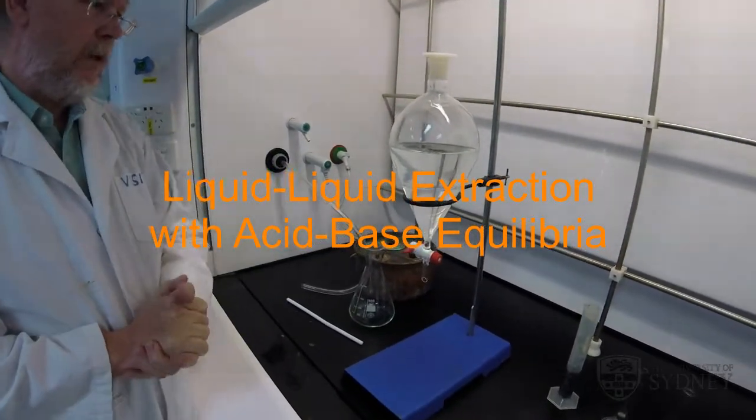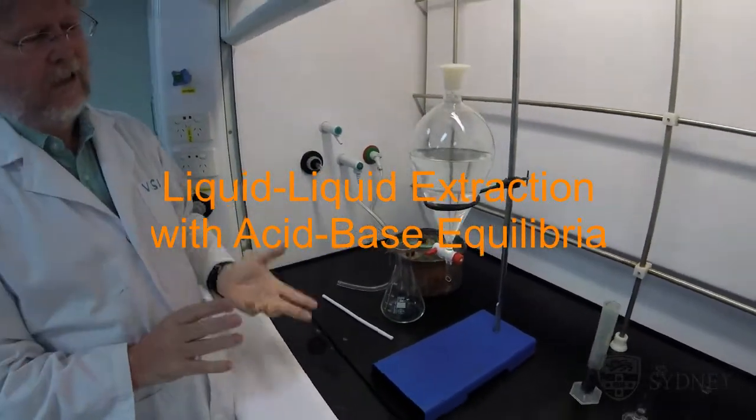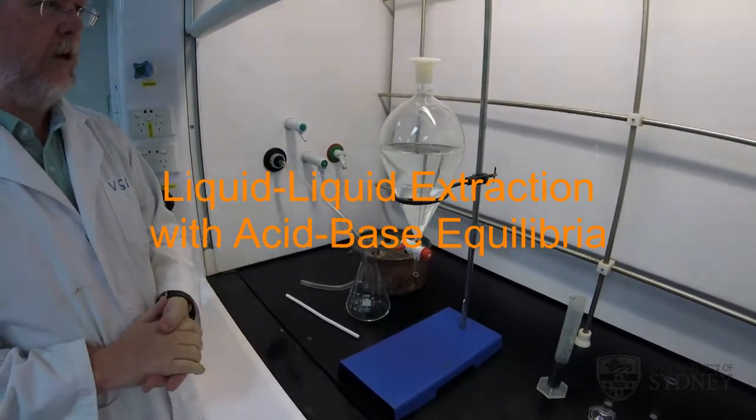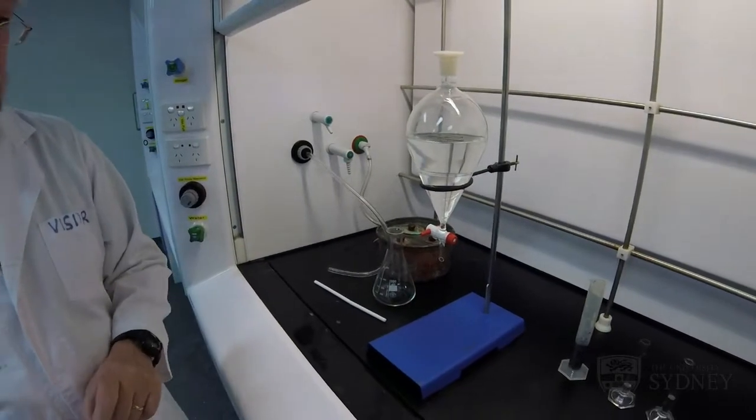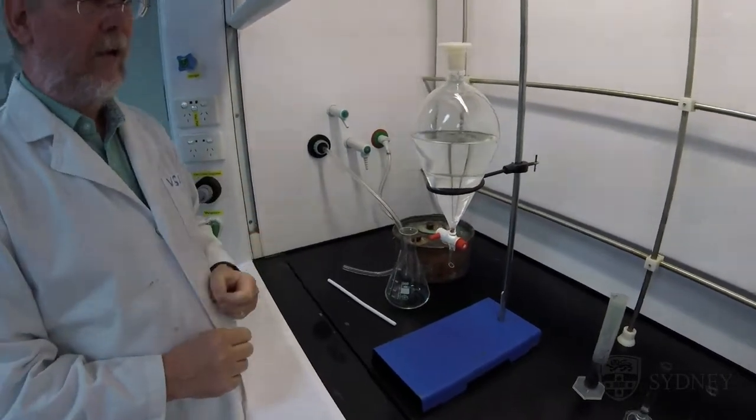Okay, so today we're going to look at liquid-liquid extraction using this separatory funnel. To illustrate how this works, we're going to use an acid-base indicator which we initially have in its deprotonated anionic form.